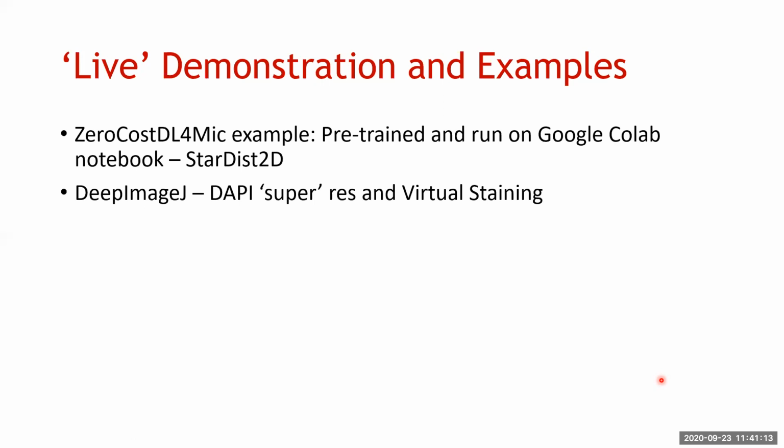Yes. There's always a way in which you can mess up your training, but there are ways in which you can play with the weights, some of the parameters that help circumvent this. The data augmentation step is pretty important.